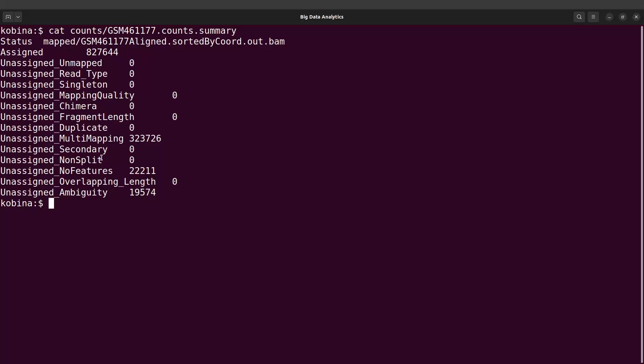Before we visualize, let's run the next sample. We'll run sample 1180, and after that we are going to visualize the results for both. Then we can see how featureCounts makes things easy for you when combining reports.